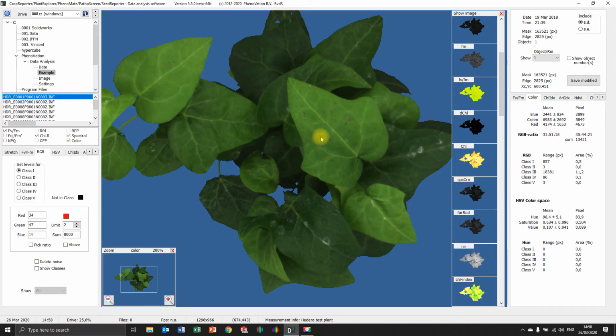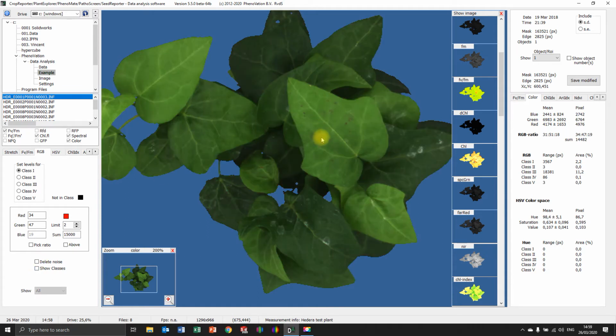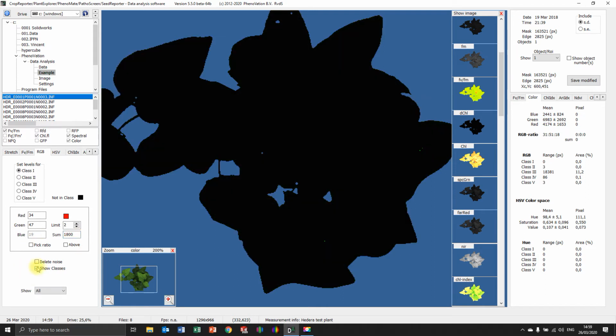And now you can say, okay, let's see, this is 13,000. Everything below 15,000 is in that class. No, not right yet, because it's more, 17 also. So everything below 18,000. Oh, sorry, I forgot a 0.